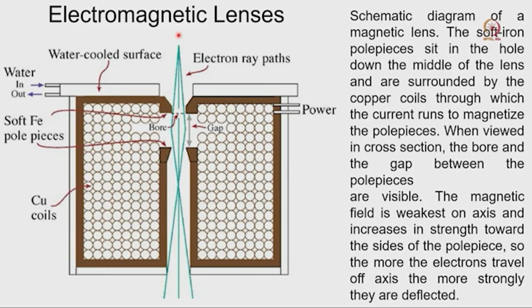The deflector regulates the electron beam and brings it back to the optical axis. As for the stigmator, if there are any artifacts or aberrations in the magnetic field, the stigmator will help us correct that aberration.